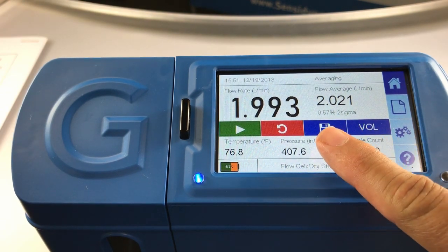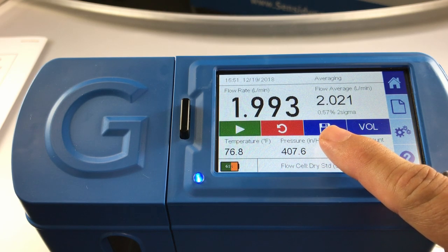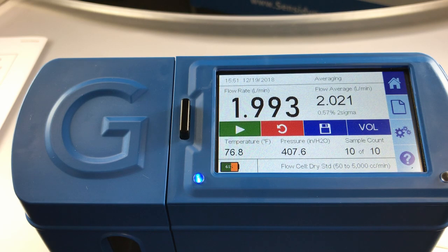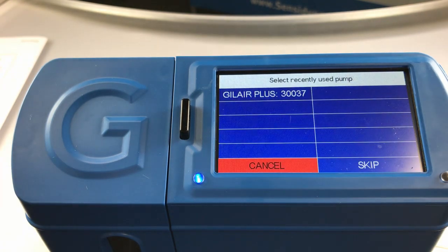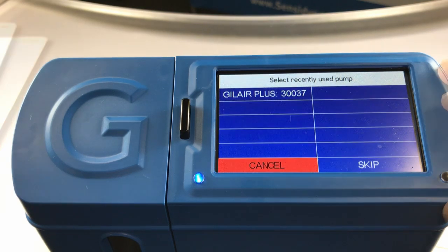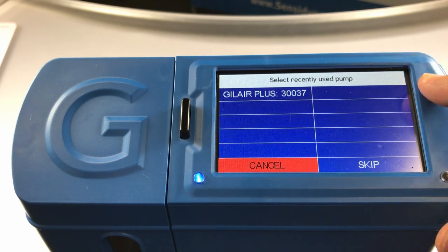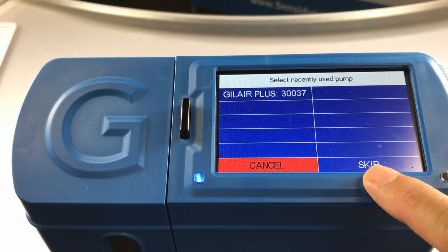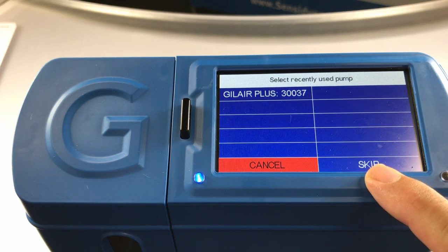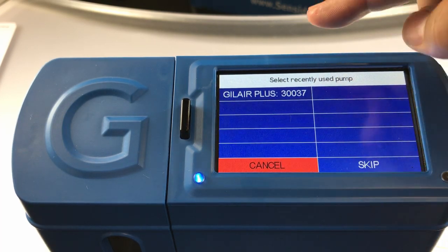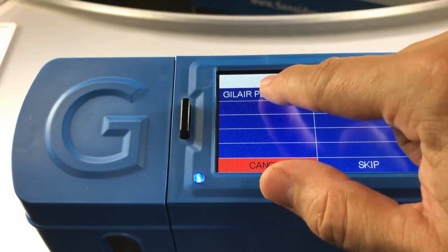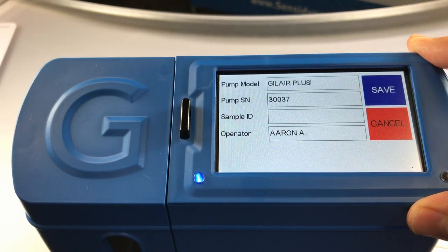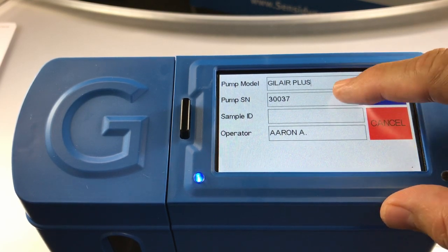The save record button will become highlighted in dark blue on the horizontal menu bar across the middle of the screen when the number of individual samples has reached the designated sample count. Touch the button with the disk on it to begin input of the record detail. The recently used pump screen will appear and populate with recently used pump information. If the flow source name is not present, touch the button labeled skip to continue to the input record detail. If populated and your flow source name is present, touch it and the input detail will become pre-populated with that pump's model and serial number.